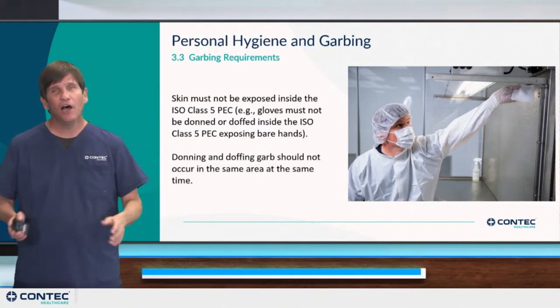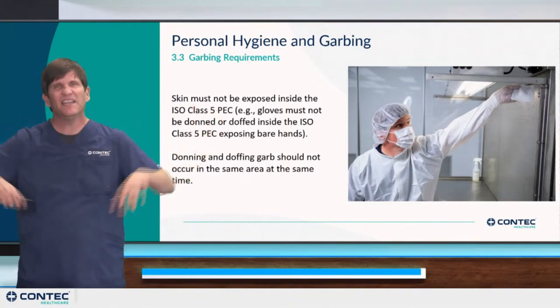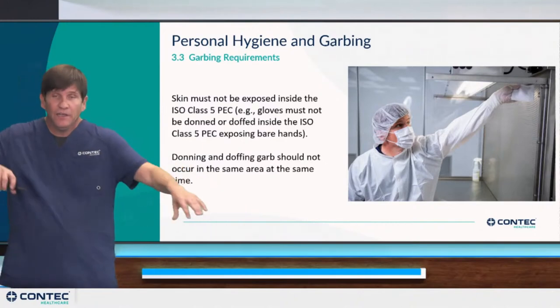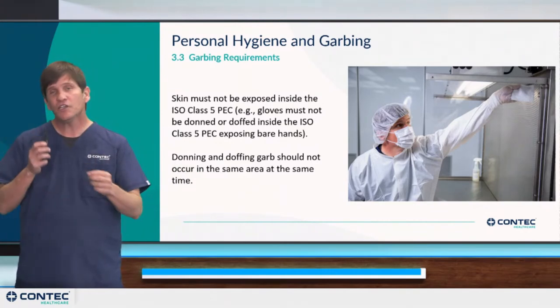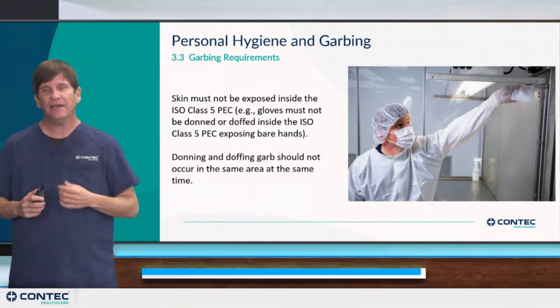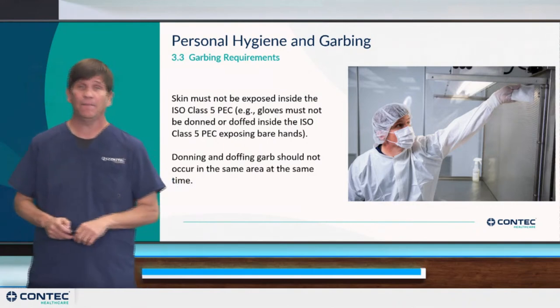The chapter also says that donning and doffing cannot occur in the same place at the same time. And that makes sense if you think about the process of doffing. When someone takes off a garment, they're actually shedding and sort of exploding particles. So you wouldn't want to have me doffing right here and my partner to come right in the room and he's donning into his clothes right there. You need to separate those areas. If you don't have the space to do that, and I realize that, you just need to pay attention and put that in your employee's head that, hey, if I'm going into the room and someone's coming out, wait here a second, let them come out of the room, doff out properly before I go in and start donning my garb. So this is specific. Donning and doffing cannot occur in the same area at the same time.